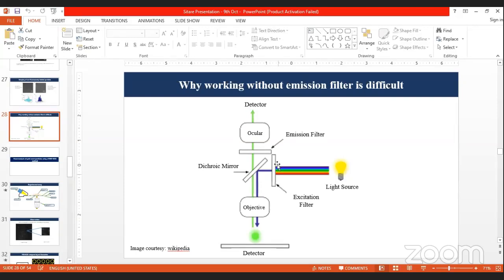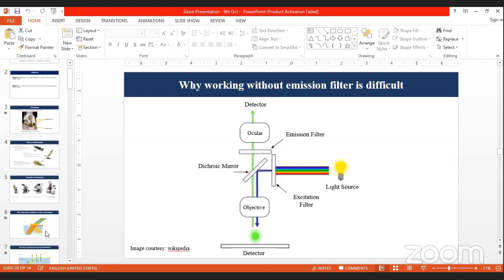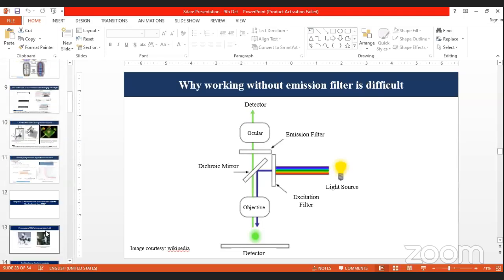So you can see, suppose there's a sample and an objective here, and the light crosses through the sample. In a fluorescence microscope, the light goes across the sample and illuminates every bit of that cylindrical volume. However, in the case of total internal reflection fluorescence microscopy, only the surface and some part near it is illuminated, and that is where it is observed.